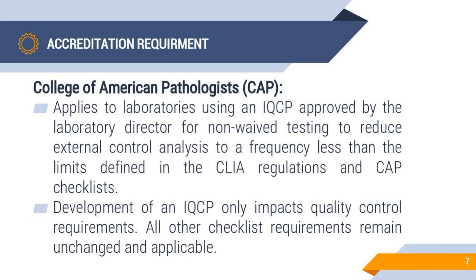Maybe some of you will say, let's make the calibration quarterly instead of monthly and do IQCP. No, this is not applicable. Don't minimize your calibration or your maintenance requirements and do IQCP. This doesn't apply.